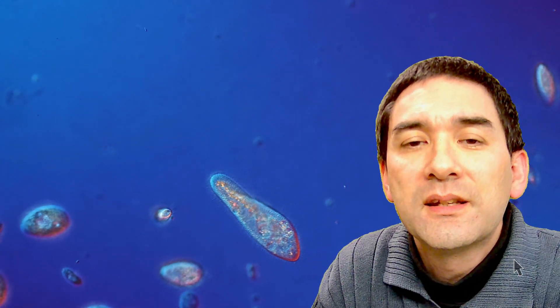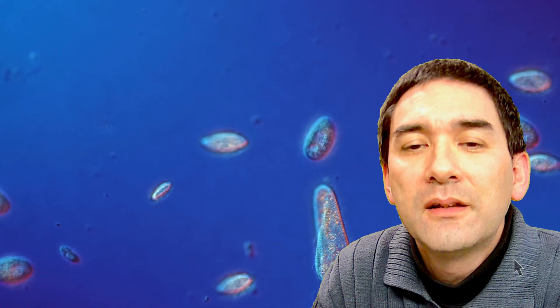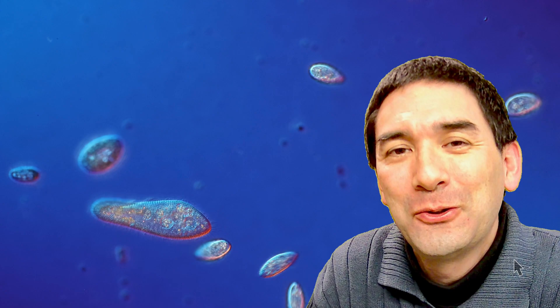Now you can see the little cilia beating again and it's moving around in a very agitated way, sometimes a little bit difficult to chase down because it immediately moves out of the field of view.